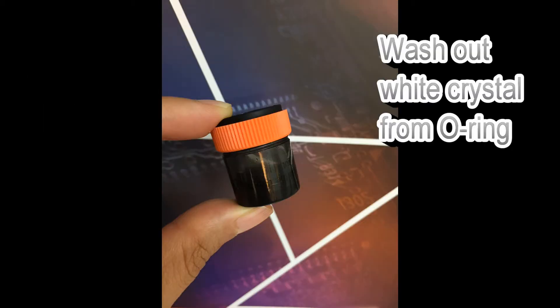Having white crystals around the bottle O-ring is normal. Simply wash it clean to keep the O-ring in good shape for long-term use.